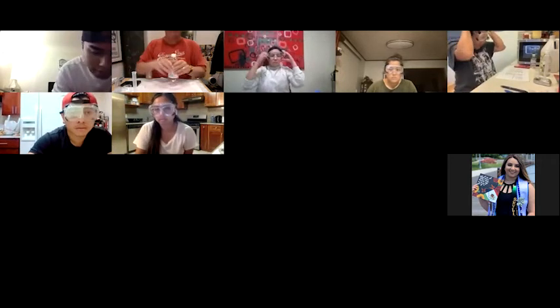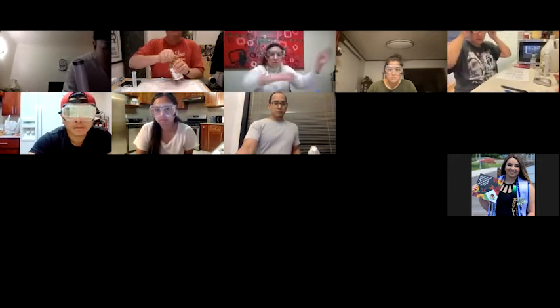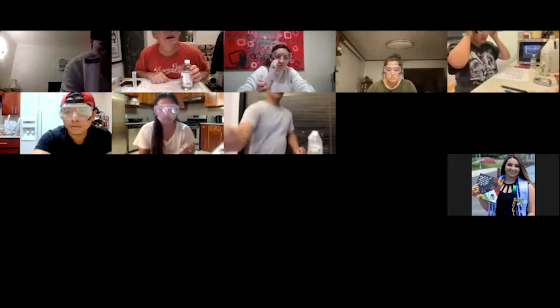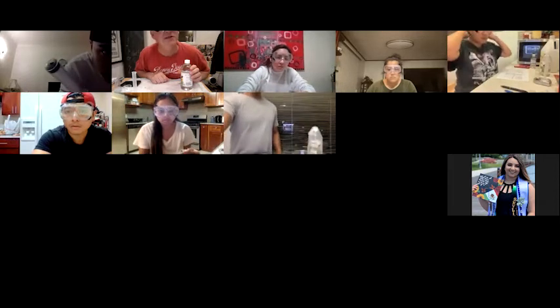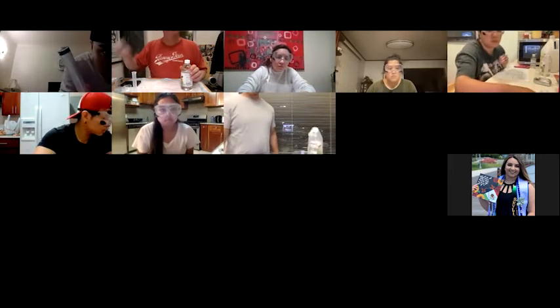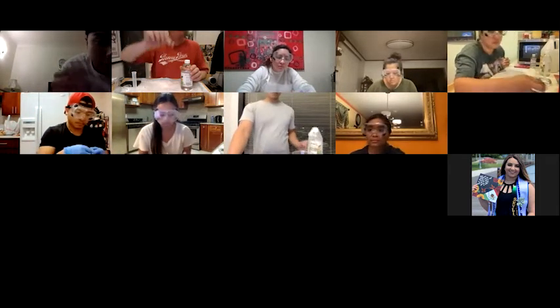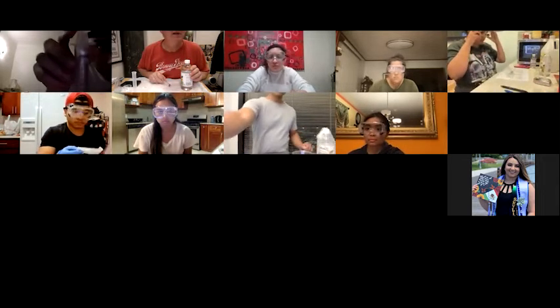Professor, I have a question. Yep. My syringe came like this. Would this still be usable for the project? It's missing this portion. Oh wait, that's the big syringe. You want the 10 mil syringe. That looks like the 25 mil syringe. It came broken.